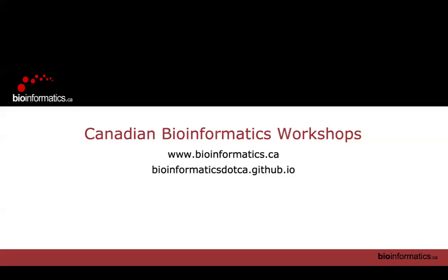Canadian Bioinformatics Workshop, Module 2, Lab number 1.